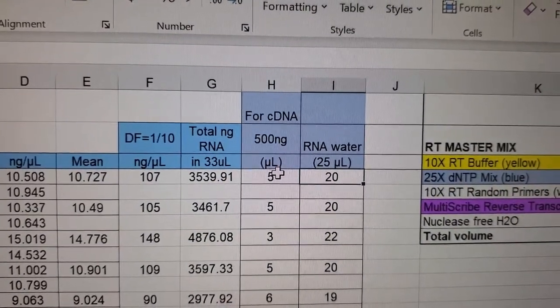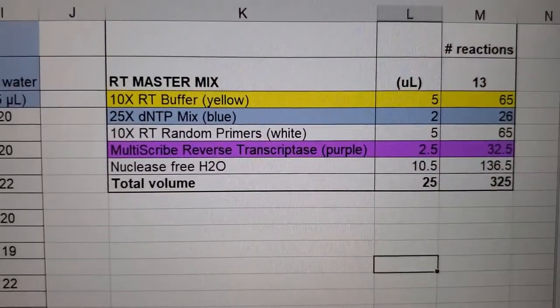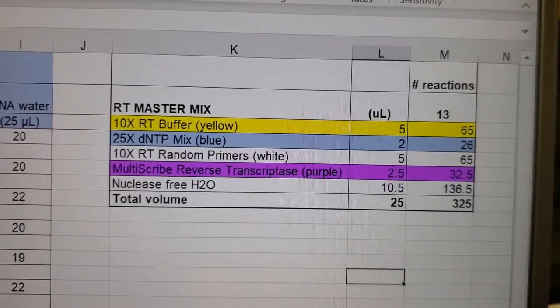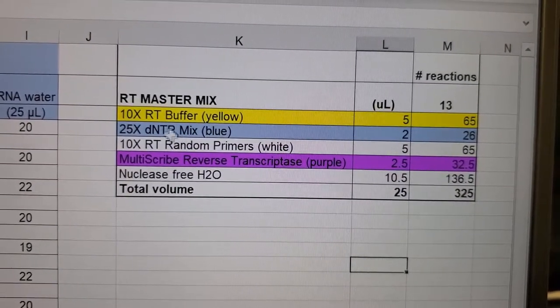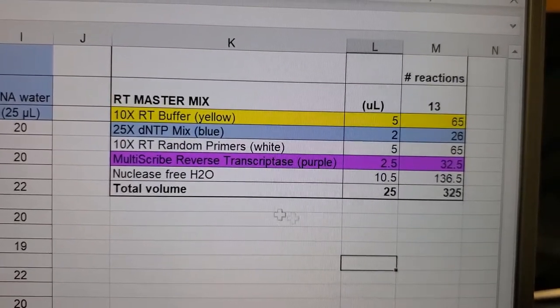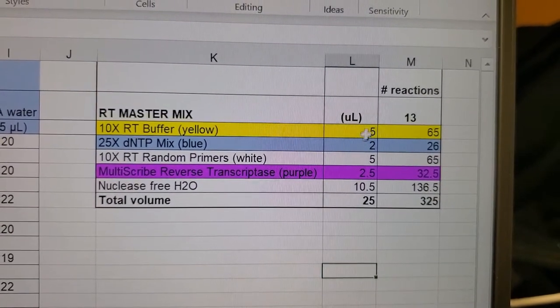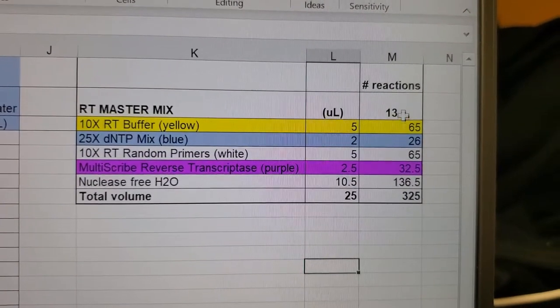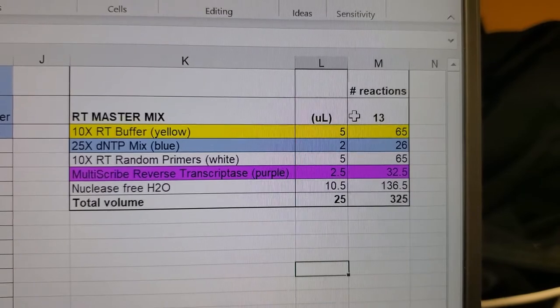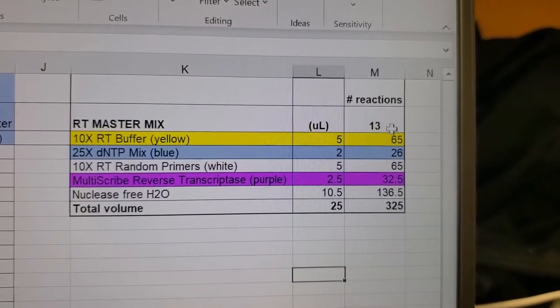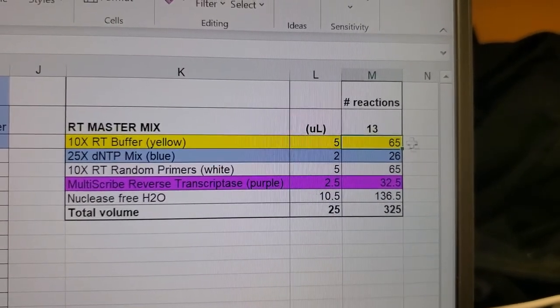Once I know how much RNA I need, I do calculations for the reverse transcription master mix. The master mix contains: RT buffer in yellow, dNTPs in blue, random primers in white, reverse transcriptase in purple, nuclease-free water — total volume of 25 microliters per reaction. Although I'm working with 12 reactions, I always add one or two extra to avoid running out, so I calculate for 13 reactions and multiply all volumes by 13.